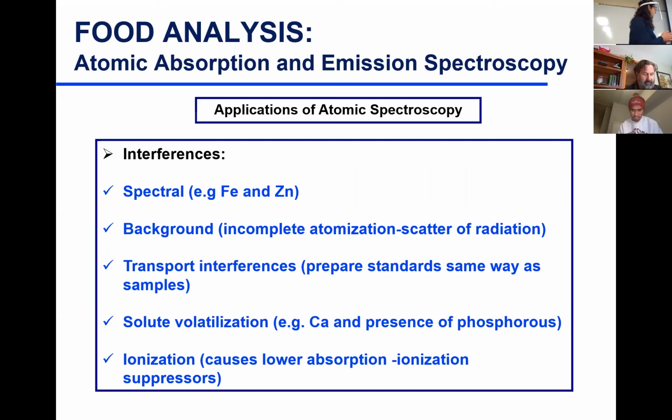Yes, of course, Chris. I was saying that when you prepare your samples, you dilute them in such a way that the concentration falls within the range of your standards. So if your standards are 1 ppm, 2, 3, 4, 5 ppm, or 5, 10, 20, 40 ppm, depending on whatever the standard linear range is, you want to make sure the concentration of your samples is within that range. So if you have a standard between 1 and 10 ppm, you want your sample to lie within there, like 5, 6, 7 ppm.